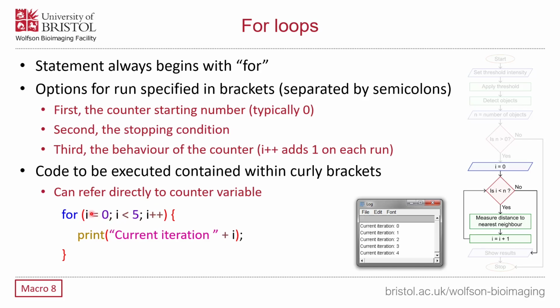And the other thing that's useful here is that we have this value. So the progress through all these iterations is controlled by the value of this assigned variable here. Now, convention is that you would assign that the value i or j, but you could call it anything. You could call it my iterator or iterable. You could call it that, but I'm just going to call it i to keep it succinct.